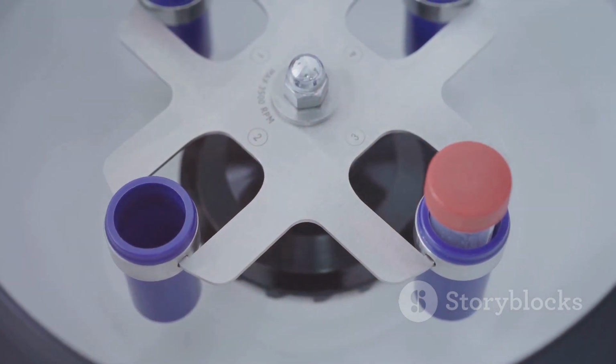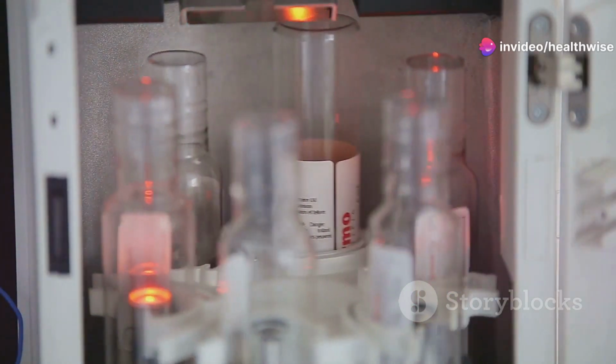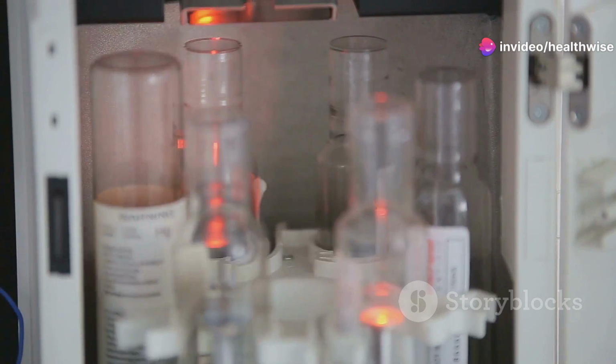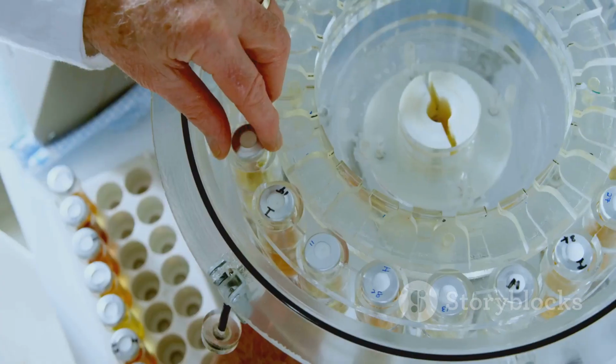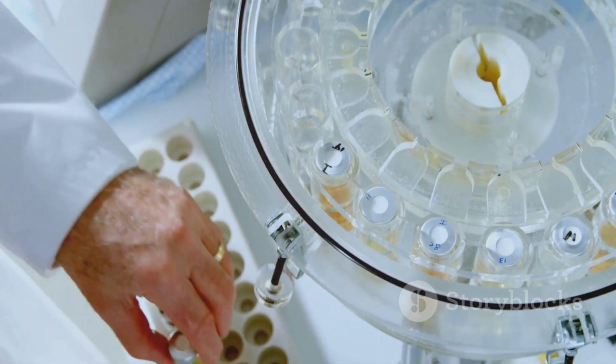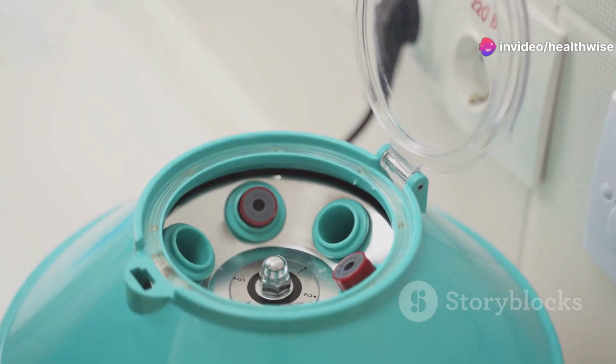Specialized centrifuges. There are also centrifuges specifically designed for unique applications. For example, microcentrifuges are tiny centrifuges used in molecular biology labs, while refrigerated centrifuges are used for temperature-sensitive samples. With so many different types of centrifuges available, there's sure to be one that's perfect for your specific needs.